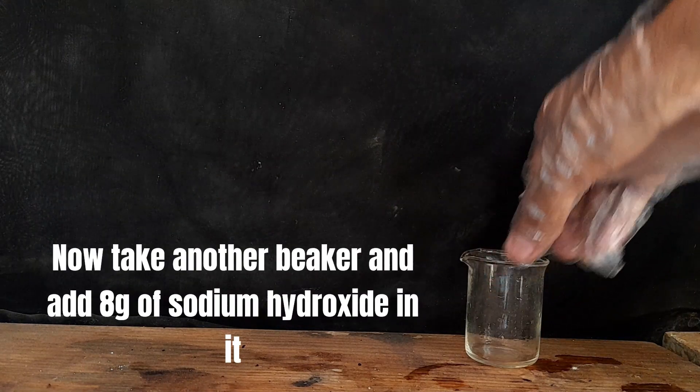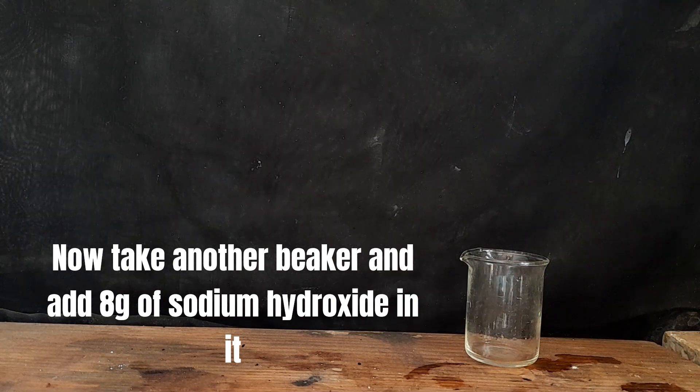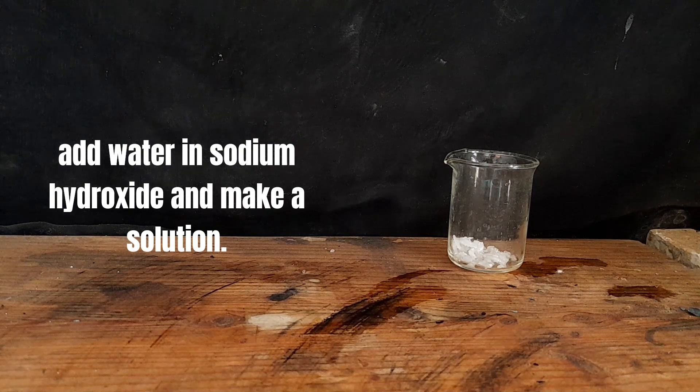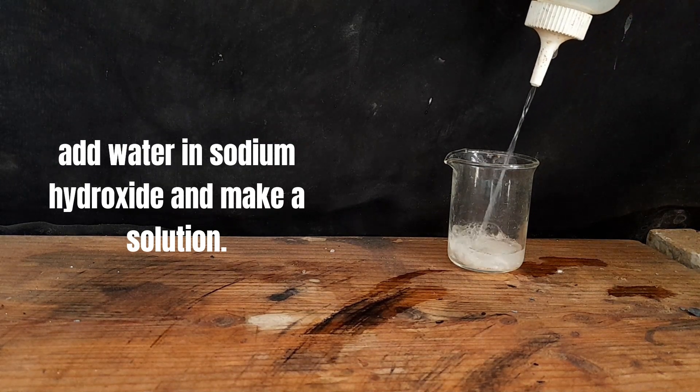Now take another beaker and add 8 grams of sodium hydroxide in it. Add water to the sodium hydroxide and make a solution of it.